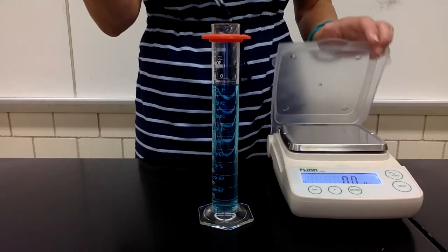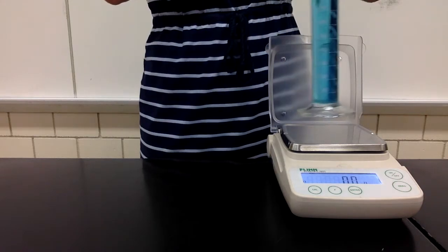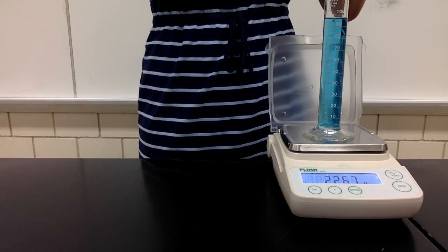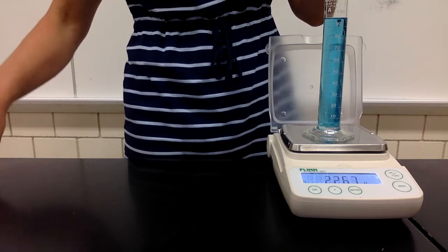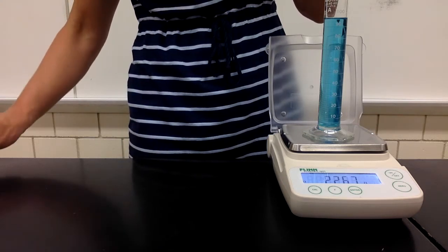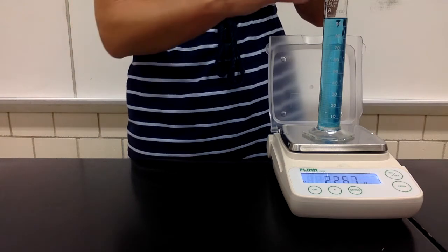Okay, I'm going to take the mass. Okay, it's at 226.7, so very close to what we started with. We started at 226.8, so that hasn't changed very much.